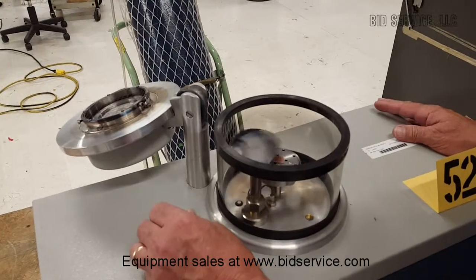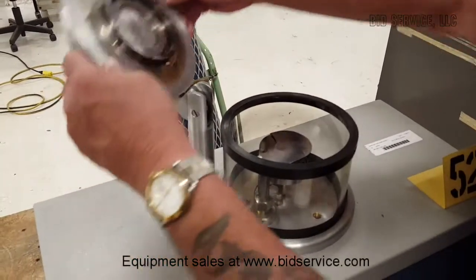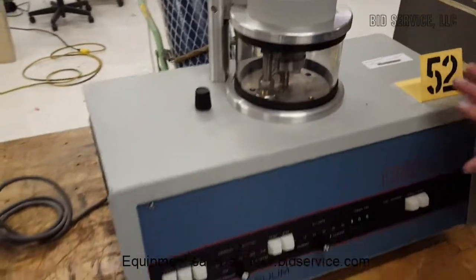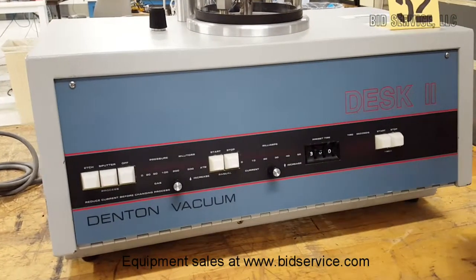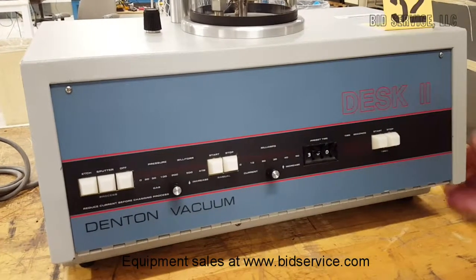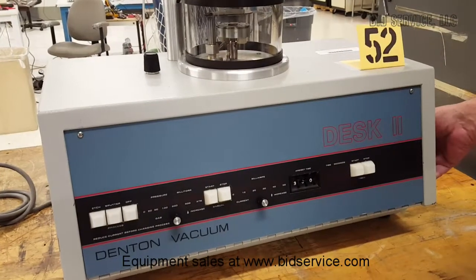I'm going to put it over to get ready for etching. This has an internal vacuum pump, so when you turn it on, it will automatically begin pumping down. The power button is here on the right. There is also a circuit breaker on the back that has to be on.